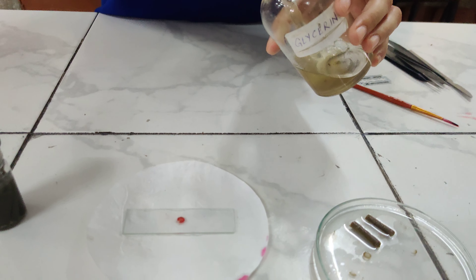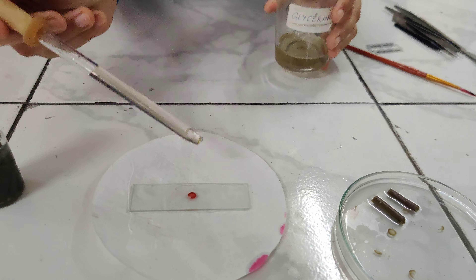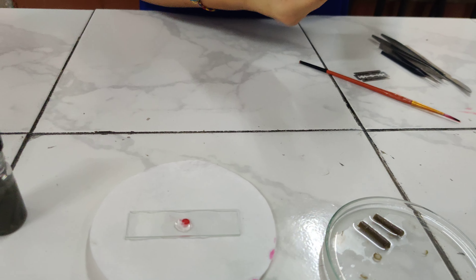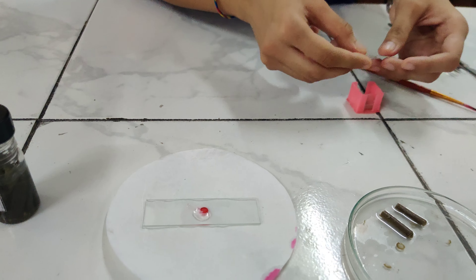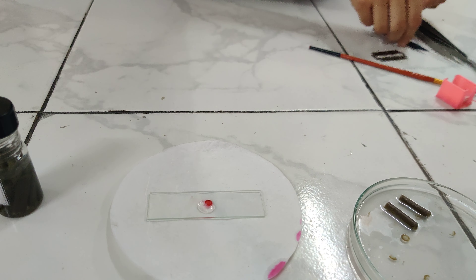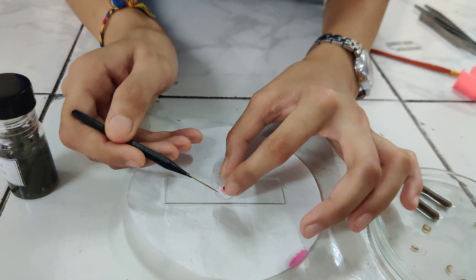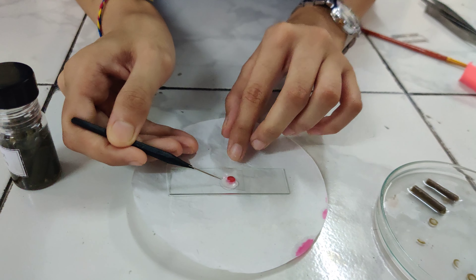Now put a drop of glycerin on the stained section. Take out the cover slip and place it on the section very gently. With the help of a needle, hold it at 45 degrees and gently place it over so that there is no formation of any air bubble.